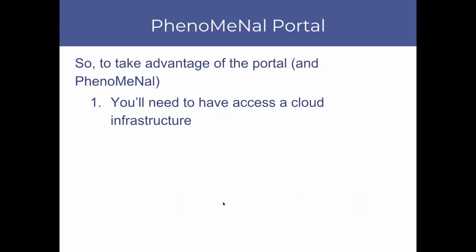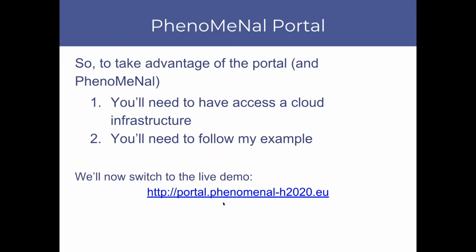So getting onto the PhenoMeNal portal, to take advantage of PhenoMeNal, you'll need to have access to a cloud infrastructure, first of all. And second, you'll need to follow my example. We'll now switch to a live demo, and I'll show you how to use the portal to do some fun things.